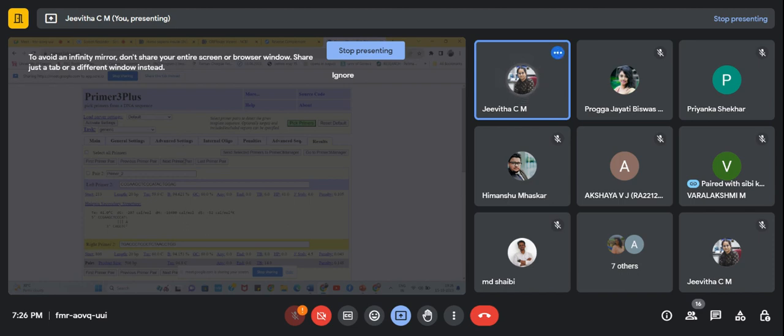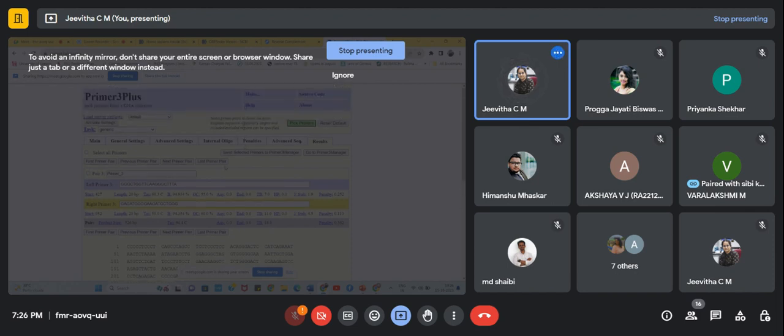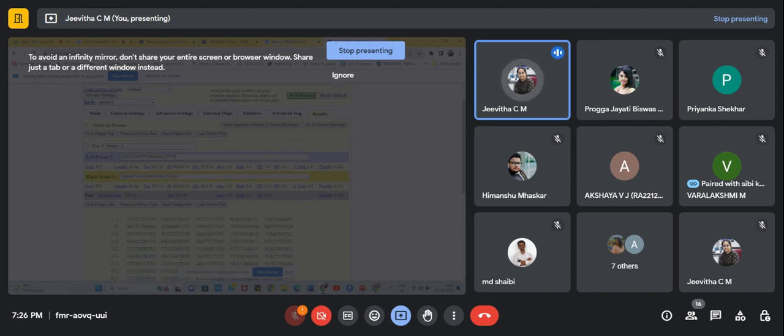And you can also look at the next primer and see whether we can take that data or not. You will have 10 primer pairs as a constant output, and you have to analyze the data by giving these primer pairs into the Oligo Analyzer and see which set of data you should take. So these are the basic things you look into in primer designing till now, like how to design the primers and how to verify them. You can't simply take the first primer pair; you have to see the conditions you are looking into. That's why we go for the Oligo Analyzer.